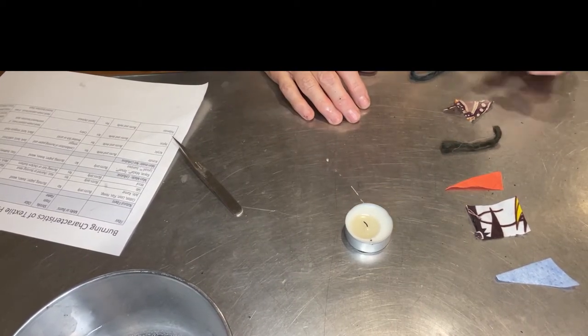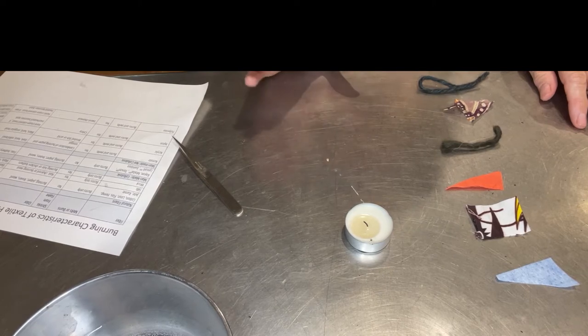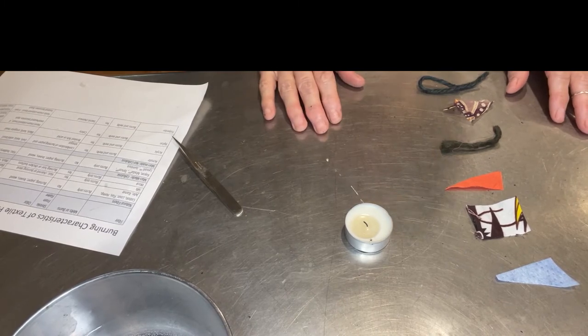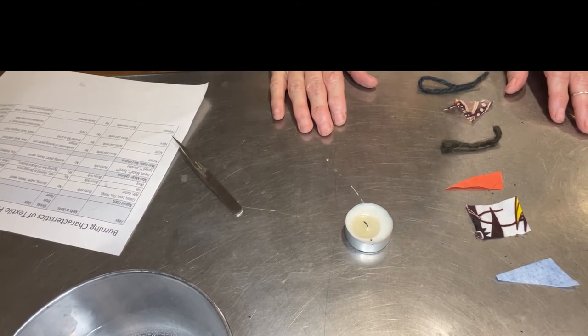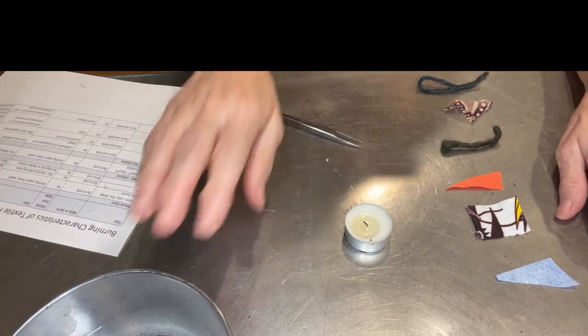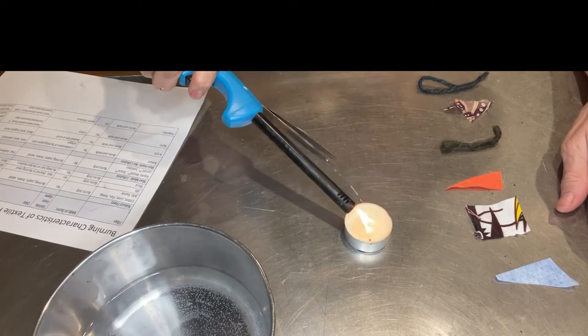Hey everyone, I'm going to show you a little bit about the burning characteristics of textile fibers. To show you how to do it, you need a table that's flame-proof — I'm on a stainless table. You can spread a piece of tin foil out if you don't have a fireproof surface. You need some tweezers to hold your material, a tea candle, your fabrics, and a bowl of water just in case things get out of control.